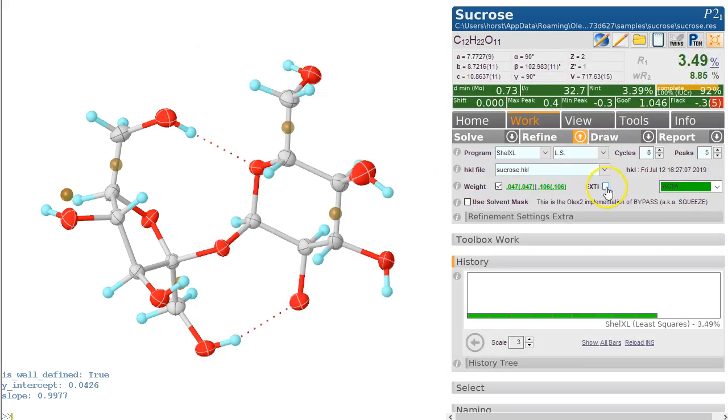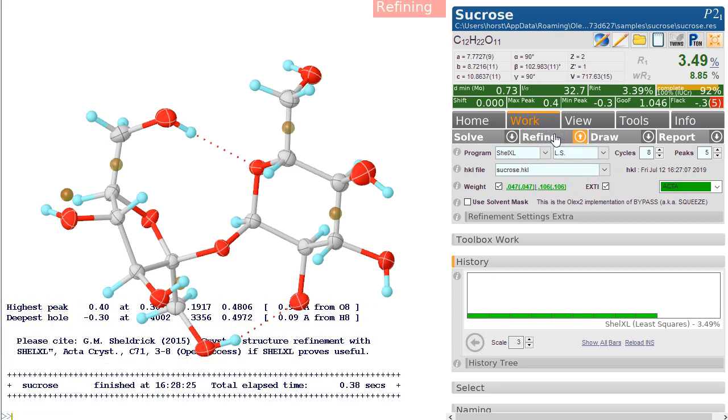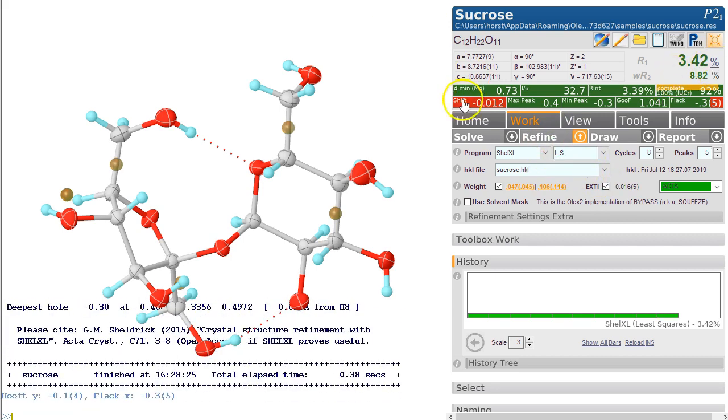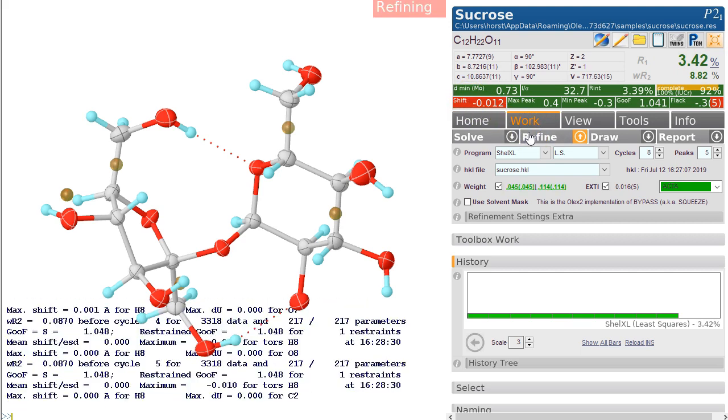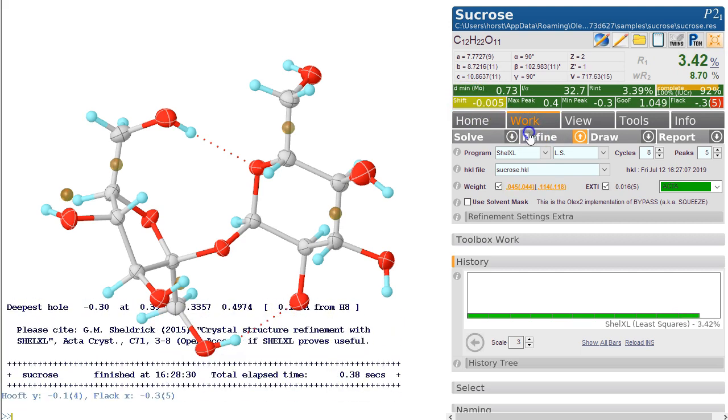That is due to extinction. If you click the extinction button on here and refine this, then this should - yes, it does make a difference. It's still not quite settled. We keep refining this until it's settled and the R-factor is significantly lower than it was before.